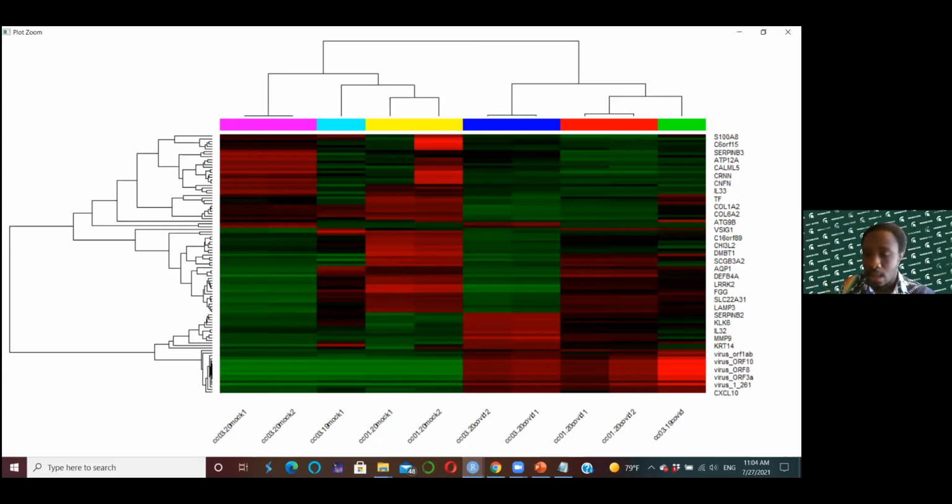And then this will give you an idea that maybe after the differential gene expression, you expected to see any of these genes as the top gene that is being downward or upward expressed in your data set.